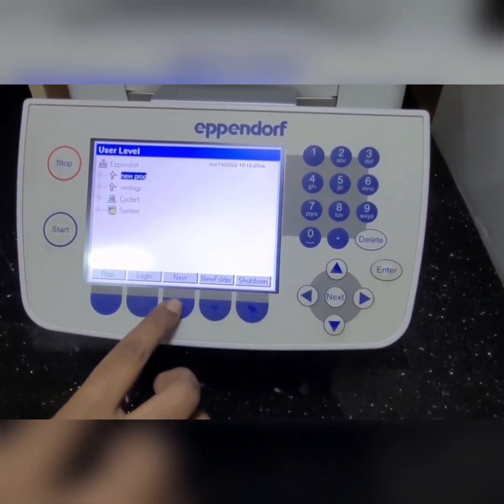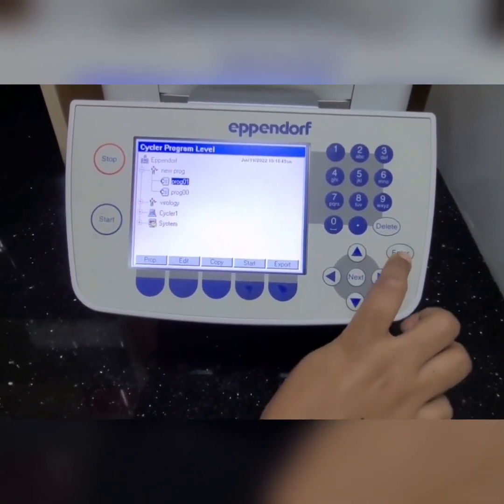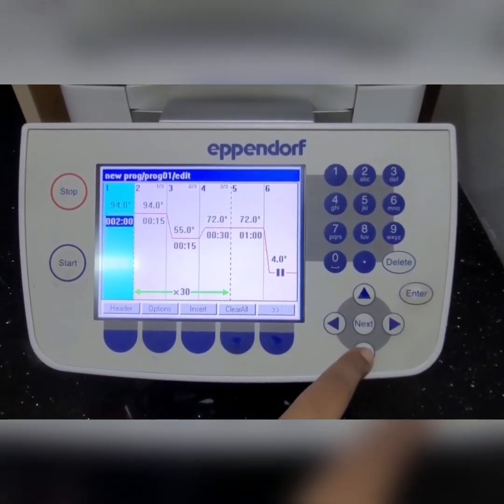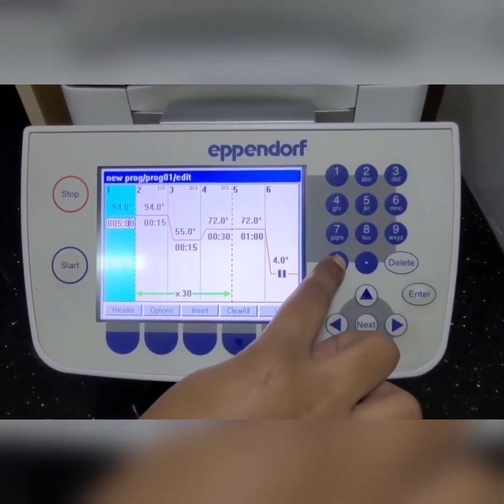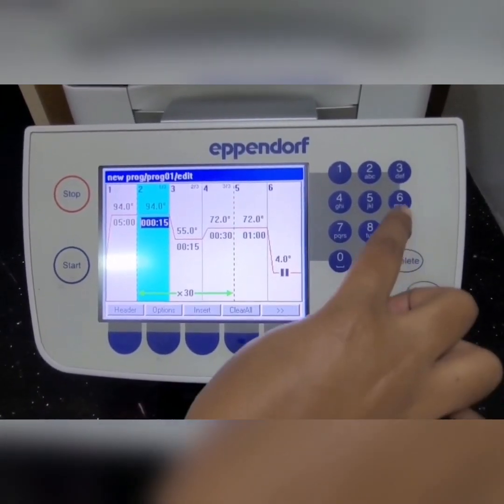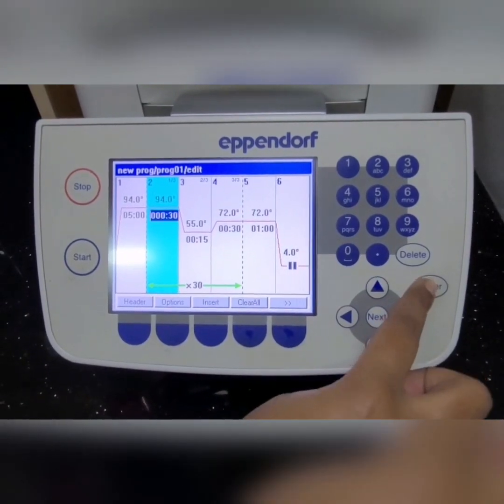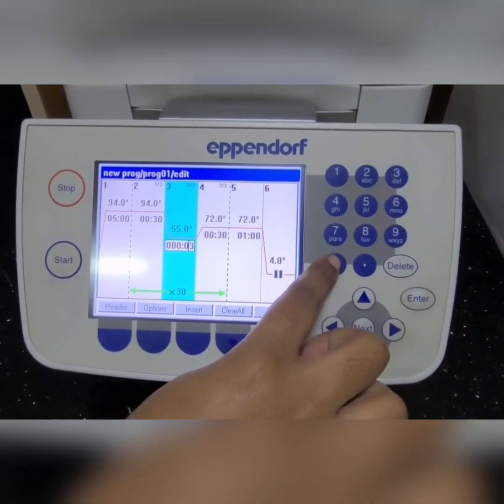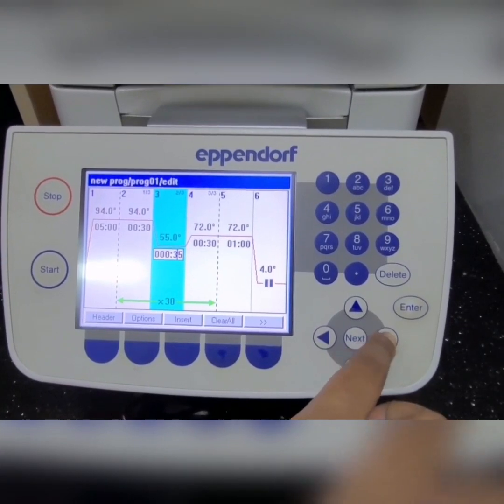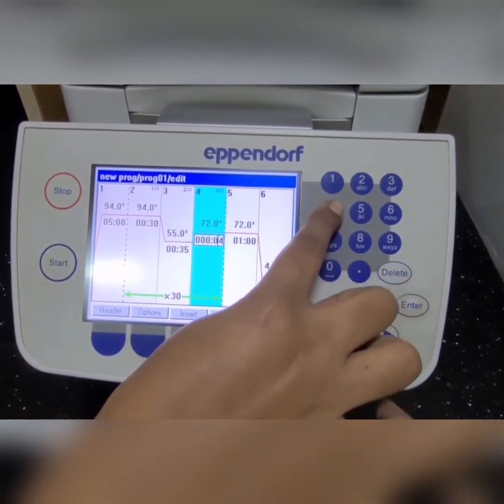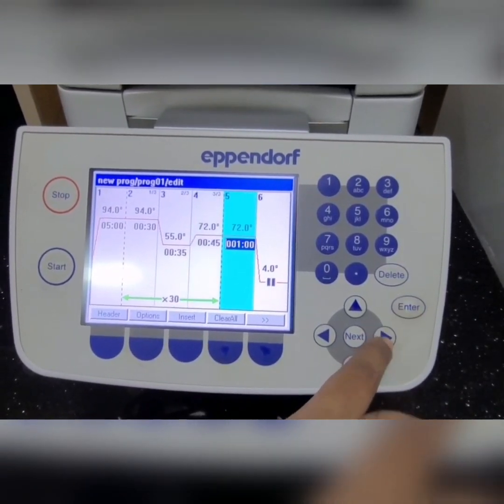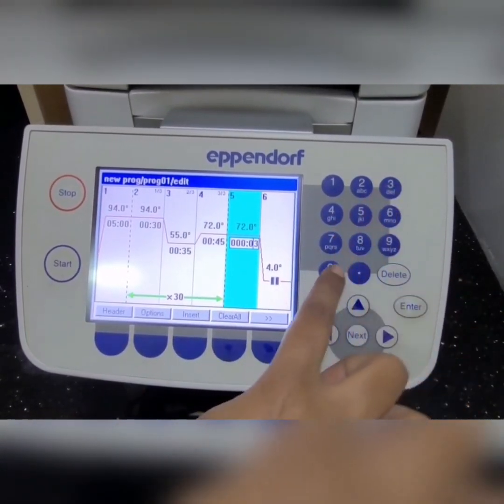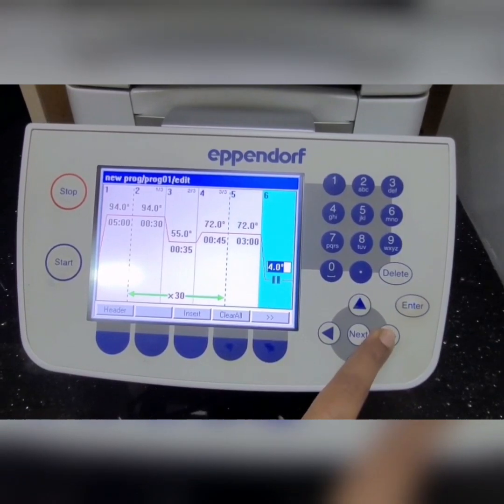As soon as you press admin, you enter into the program already set in the machine — the highlighted one can be edited. By pressing the number keys, based on your PCR reaction conditions, you can modify the temperature as well as time. To change the cycles, press the down arrow key. To move left and right use the left and right arrow keys, and to move up and down use the up and down arrow keys. Whenever a step is highlighted in dark blue you can change its setting.